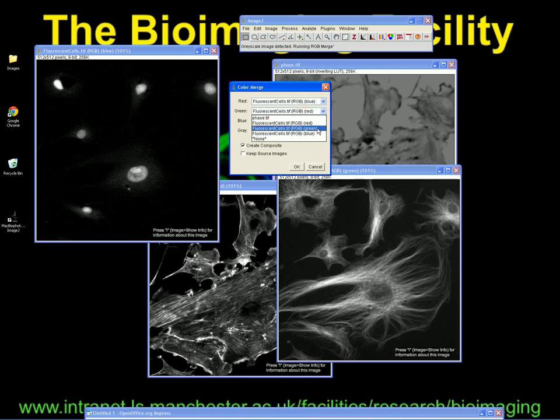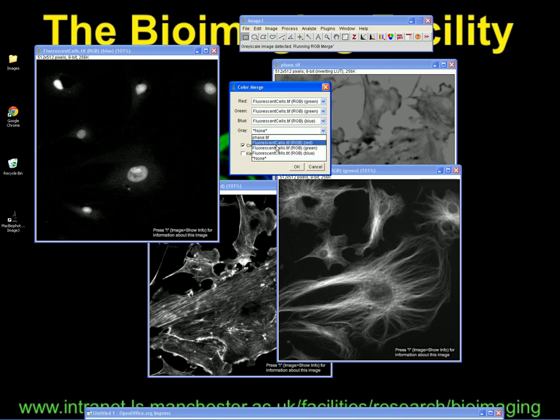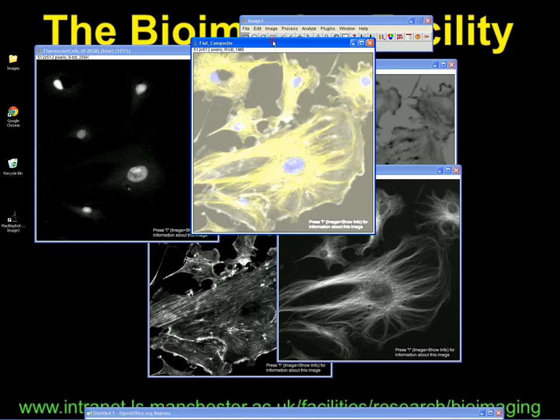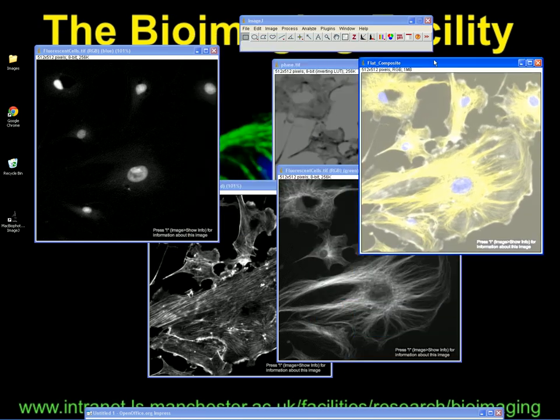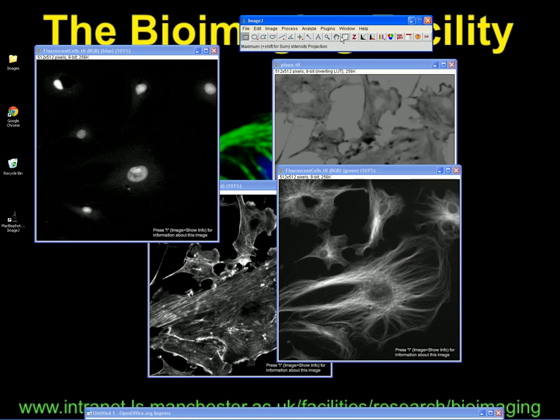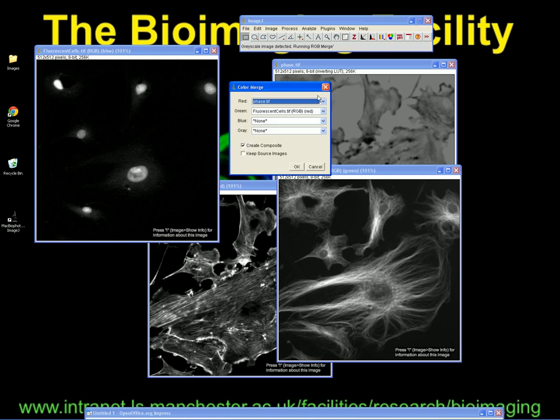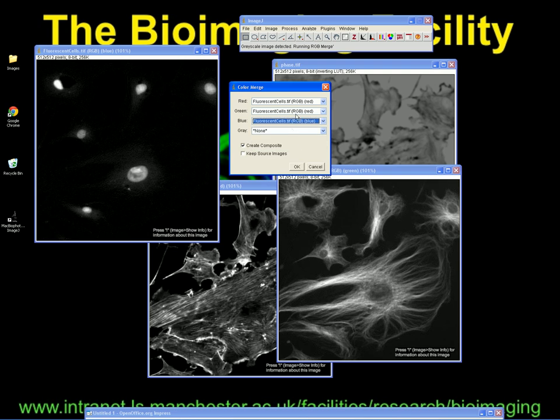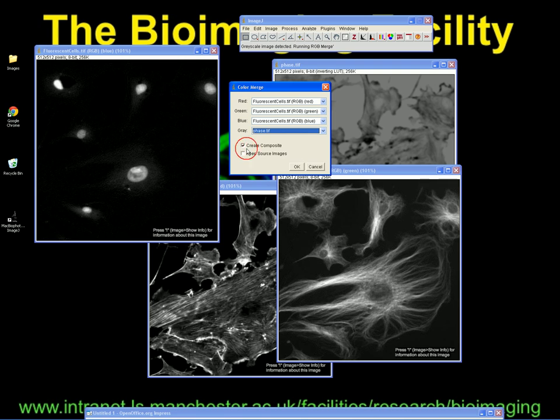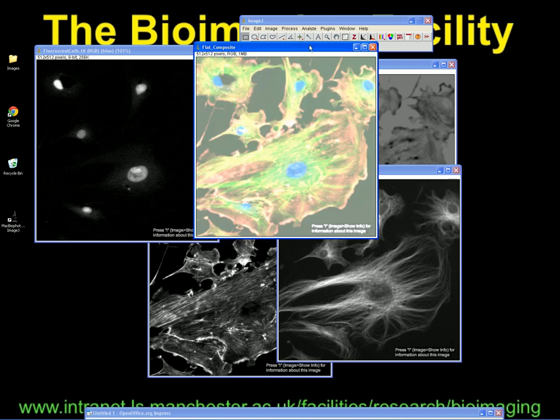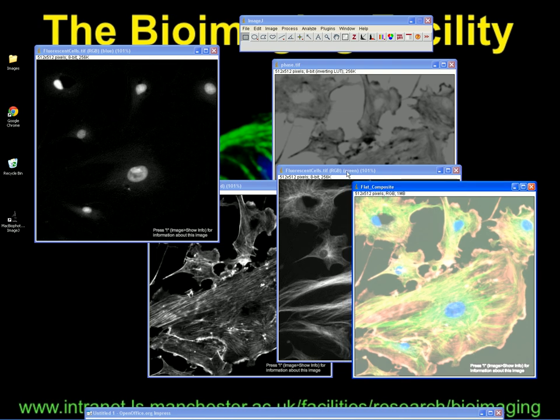So you've got the blue and the green. After correcting the channel assignment — the red is the red, the green is the green, and the grey is the phase — keep source images. That makes more sense. So now we have all of these images. It's going to start to look quite a messy montage when you make it because there are going to be a lot of boxes, but it's possible to choose which ones you use.